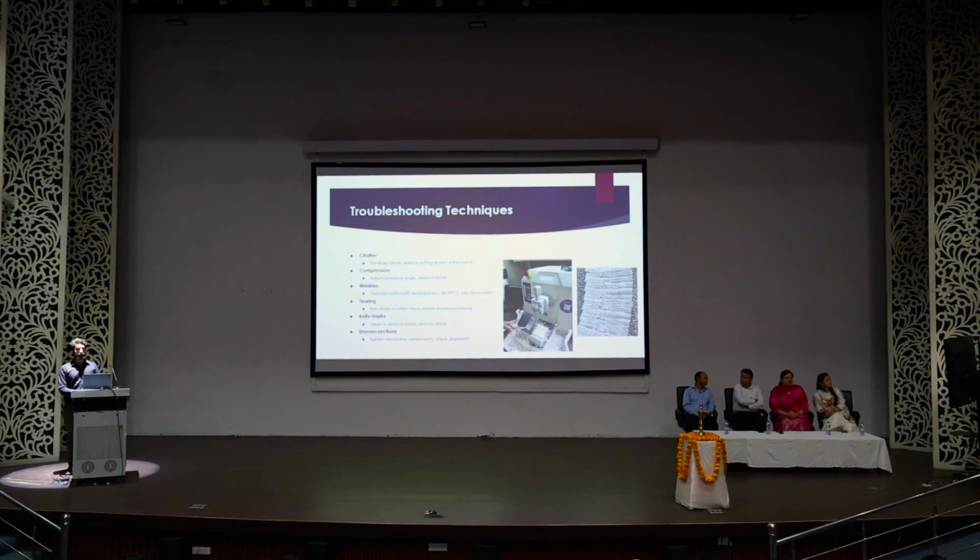How do we troubleshoot these problems in microtomy? For chatter, use a fresh blade, slow speed of sectioning, and soften the block by increasing its temperature. If the block is hard because of cooling, fine. If it is hard because of calcification, then, as Fayaz already said, we have to go for decalcification. For compression, adjust the clearance angle and replace the blade.